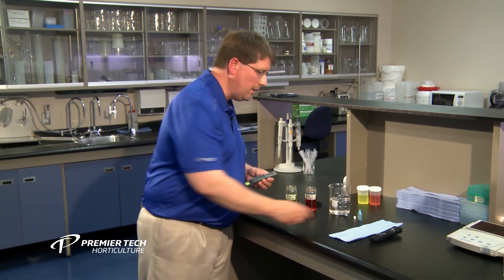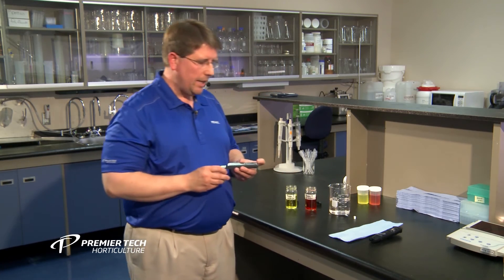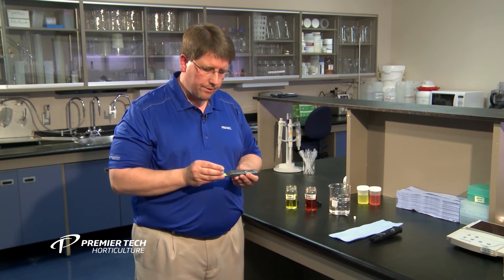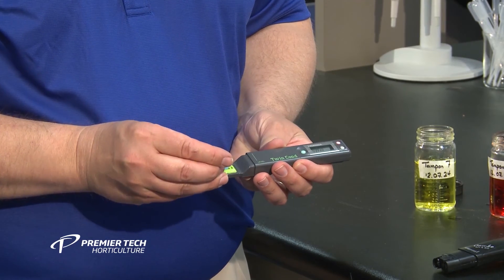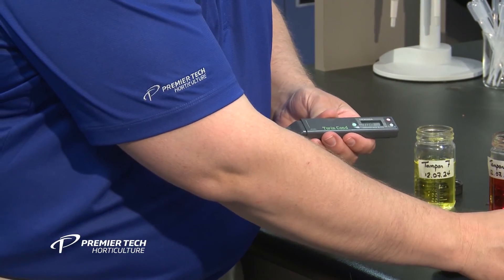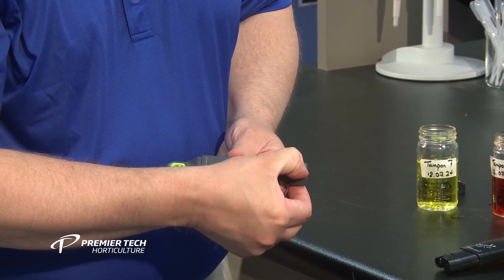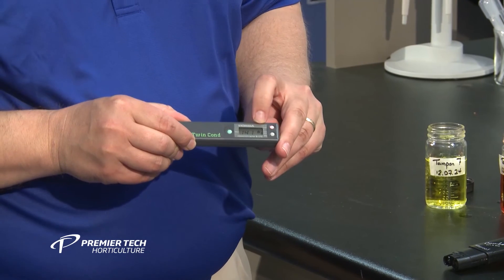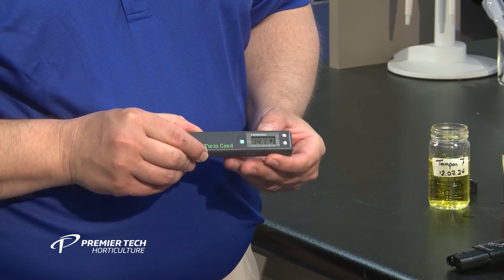This particular EC meter is fairly easy to use. You essentially put it into calibration mode, take your calibration solution, and put it inside the calibration cup. Then you put the meter into calibration mode itself. Once the reading stabilizes, you're ready to use your EC meter. Now that calibration is completed, you're ready to take it out in the greenhouse and test soluble salts on water, fertilizer solution, or growing media.